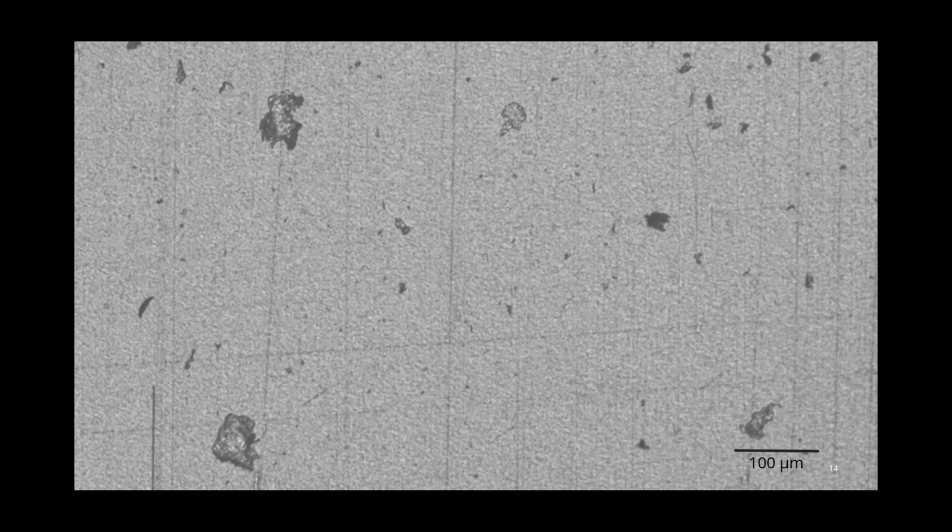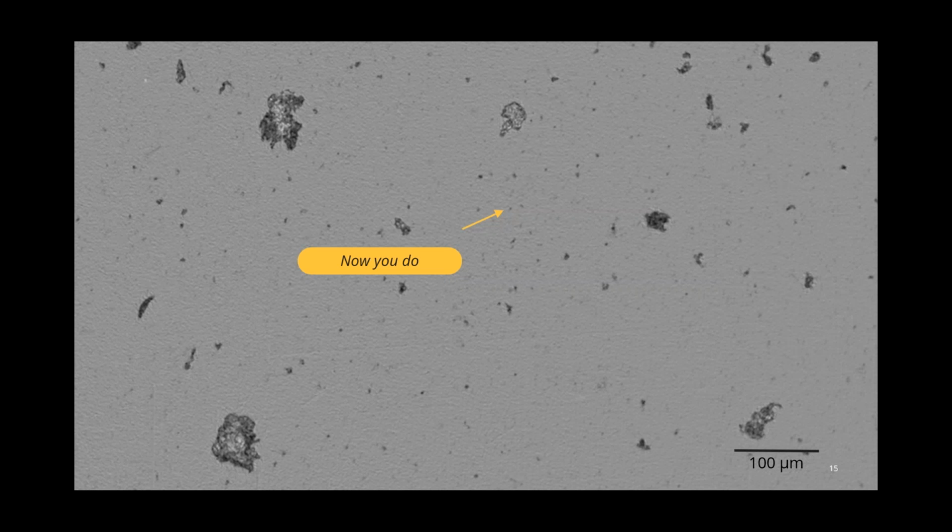And then we reinsert the plate back on the Aura system, and what you see now is essentially an image of the particles superimposed over the membrane, right? They're lying over the membrane, but the fact that we imaged the membrane in advance allows us to register those images and do a pixel by pixel subtraction to distinguish the topography of the membrane from the true particulate material. And not only that, but because this is done in a dry environment, it enables high refractive index measurements that allow for reliable results.